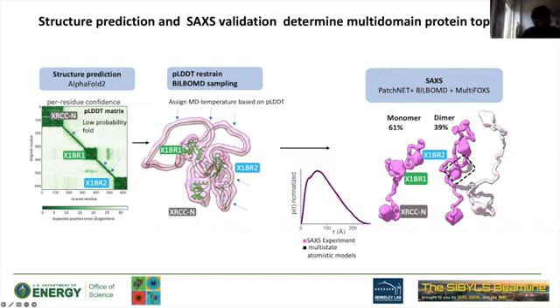On top of it, the SEC-coupled SAXS shows that this protein is not in a monomeric state, but also from the molecular weight, we see it's not in a dimeric state. And from the broadening of the peak, I don't have the picture here, and we will show in our tutorial that's exactly what happens for lots of proteins, this is a monomer-dimer mixture.